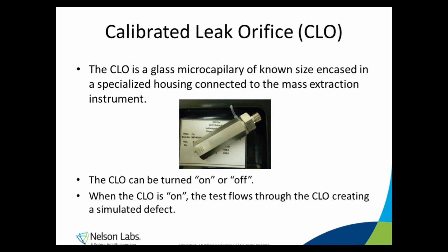Intentional defects from laser drilled holes or sealing wires into the closure have some problems, and many sample types are not suitable for microtubes or microcapillaries in this test because the fixtures are so custom fitted, there just isn't room for them. So this is a feature we really, really love about the instrument.